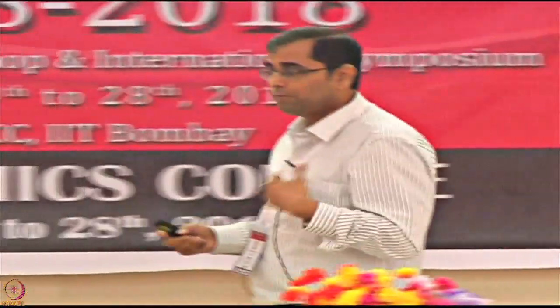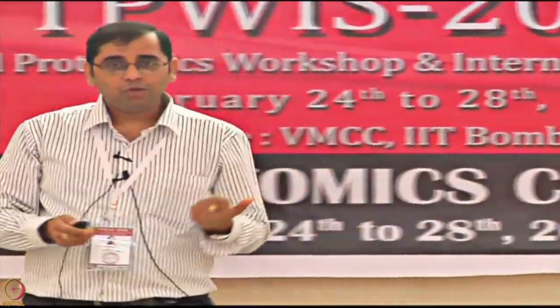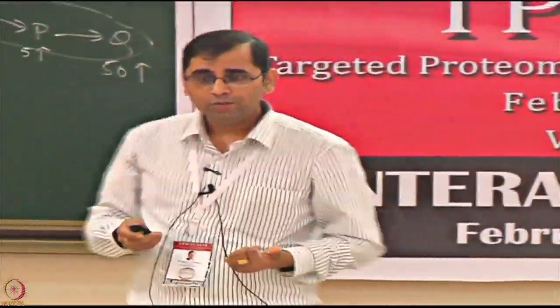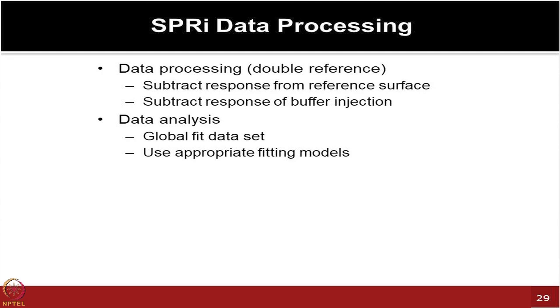Of course, you need to do better fitting of these curves to find out the actual values for concentration or the KD values. But many times these experiments give you a lot of visual feel for those analyses. But as I said, if you want to really get the proper values, you have to do good cropping, you have to do good fitting.